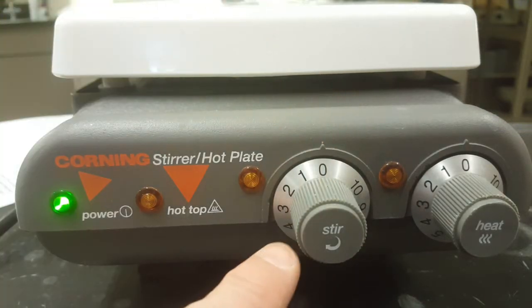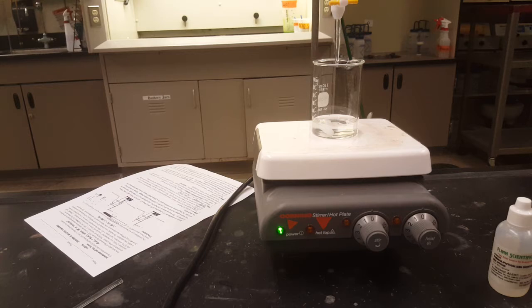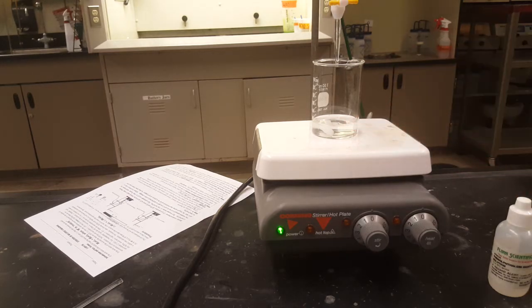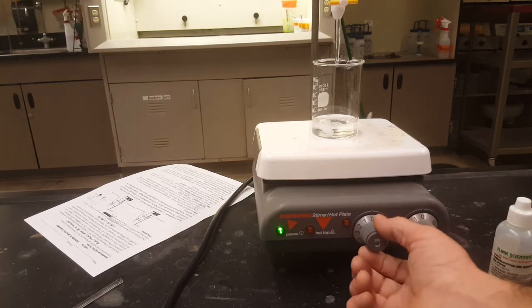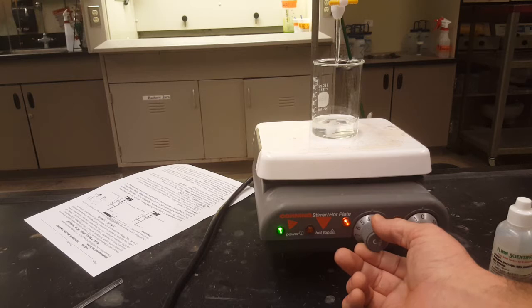The stirring part is kind of fun. Let me back up and show you how this works. That magnetic flea that's inside of your acid, if you start turning your stirring up, is going to start turning around. Now you don't have to worry about stirring your acid.